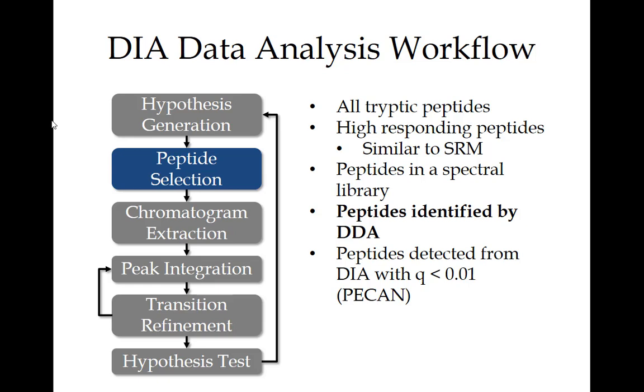So that's taking all of my comprehensive stuff and everything I said about why you wouldn't want to do DDA and kind of throwing it out the window. You are limiting yourself to peptides you identified in DDA in this case. However, you're using the DIA data to have better quantification on those peptides because of the better selectivity. So this is an easy starting method for people to get their heads around. It's not what we actually do in the lab, but that is what we would do.